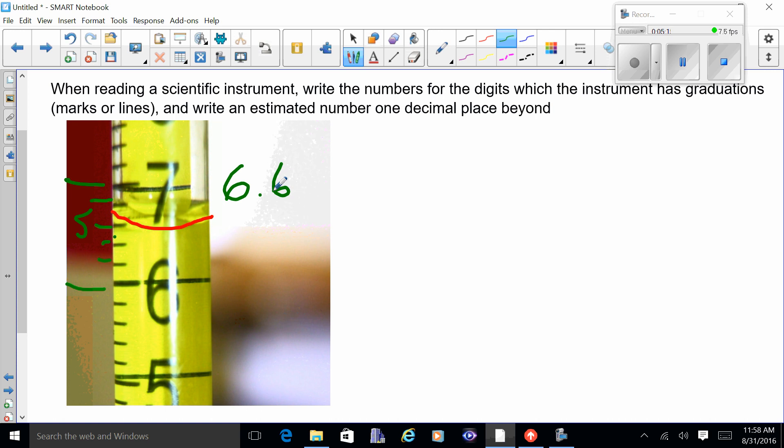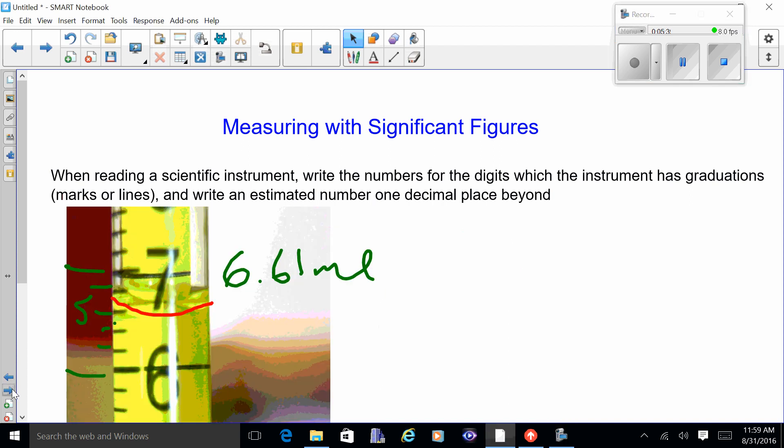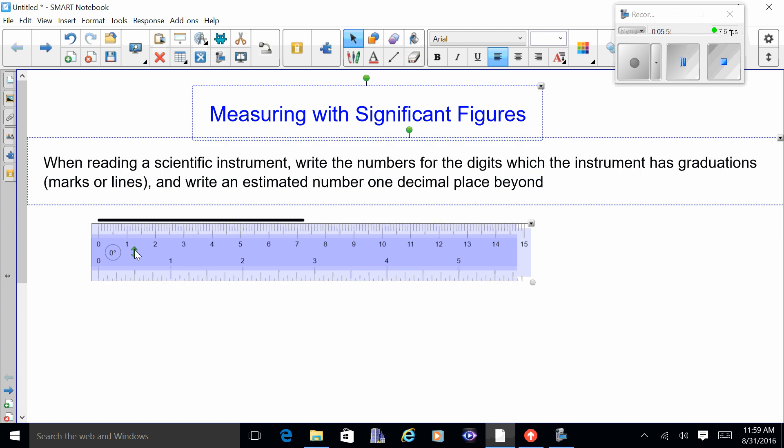Going back to compare: the first graduated cylinder had lines for the ones digit, so we knew 56 and estimated out to 56.8. The small graduated cylinder had lines every 0.2, so we knew 6.6 and had to estimate an extra decimal place to 6.61. Going back to the ruler, the lines went out to 0.2, so knowing 7.2 we took it one more spot and wrote down 7.28.